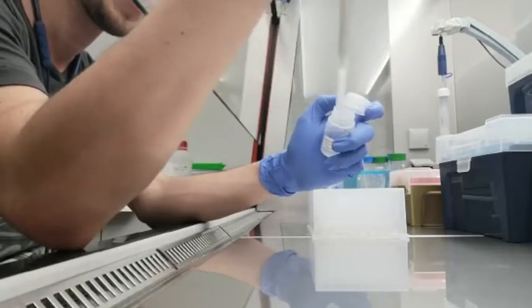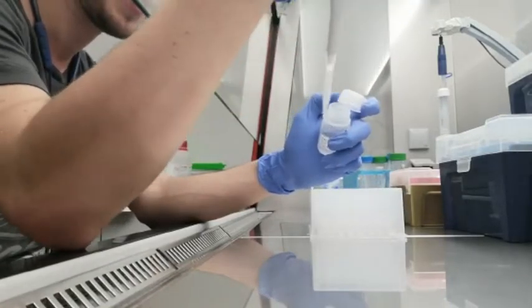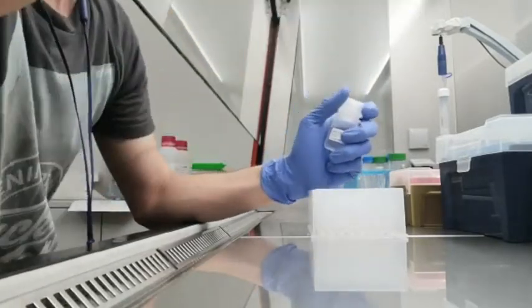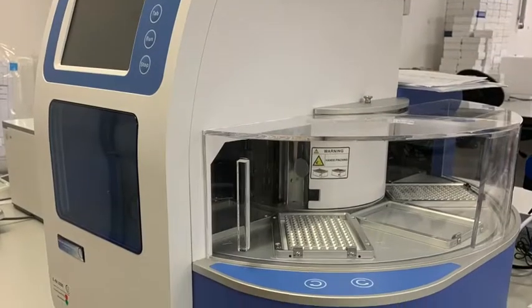Once you have prepared your plates, go to instruments and turn it around till you see position 2. In position 2, put your lysis buffer plates that includes now your samples as well as the beads. Insert it in the way described in the Pure 96 video by inserting the wells adjacent to the positions of the Pure 96 device.